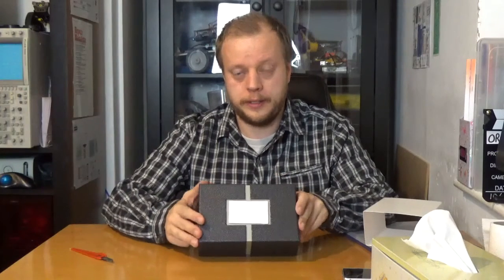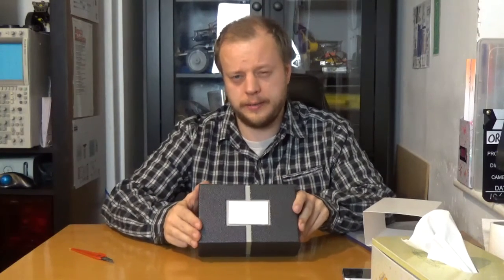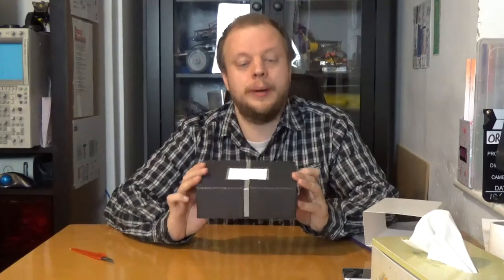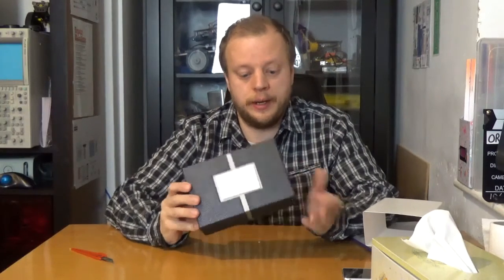This is a USB microscope. I believe it gives two or three hundred times magnification, which should be enough for my purposes and it'll be a load of fun. I can play with this with the children - we can go and look at the grain of the table, look at hair.